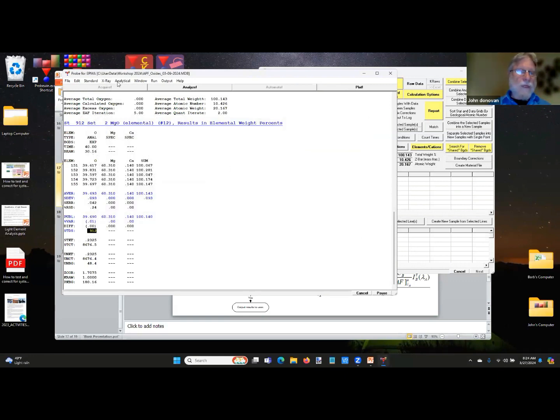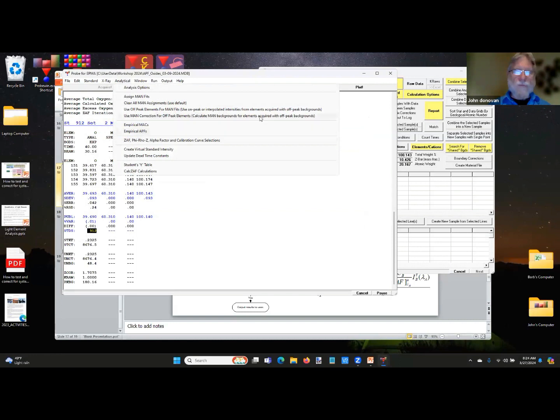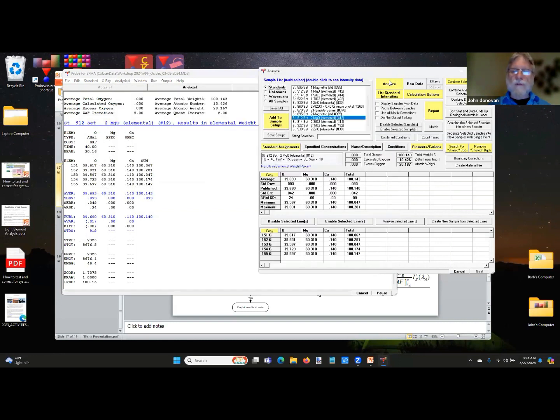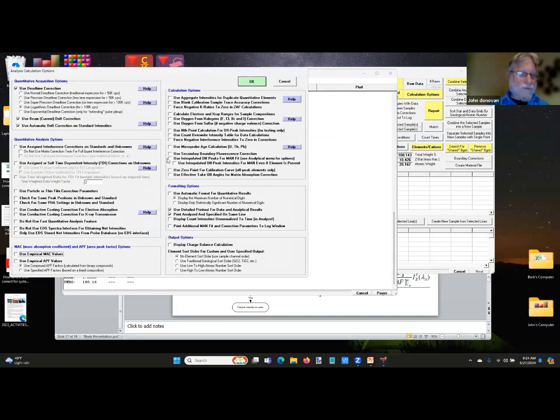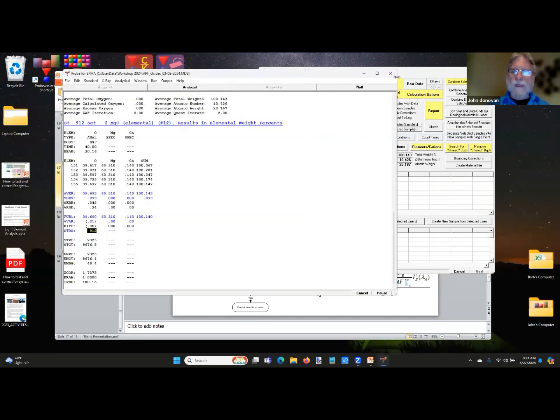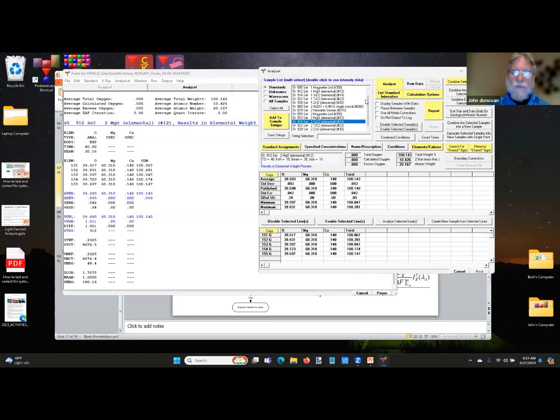And then if I go and look at the area peak, okay, let's just do the max first. And now, oh yeah, sorry, I'm going to turn that off again because I wanted to show you one thing. Turn off the empirical MAC values. Let's analyze SiO2.